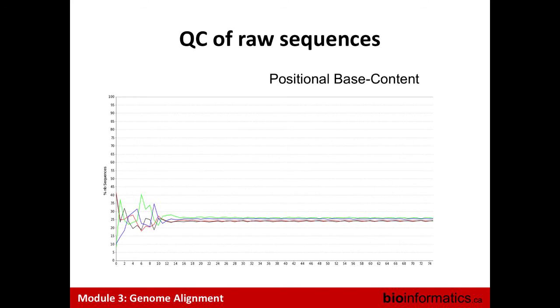So you expect, if you are working with exomes, 50% GC, 50% AT, so 25% of each base. If you work in whole genome, you will expect 40% GC, so 30, 30 and 20, 20, depending on the experiment. You will expect to see different types of graph.